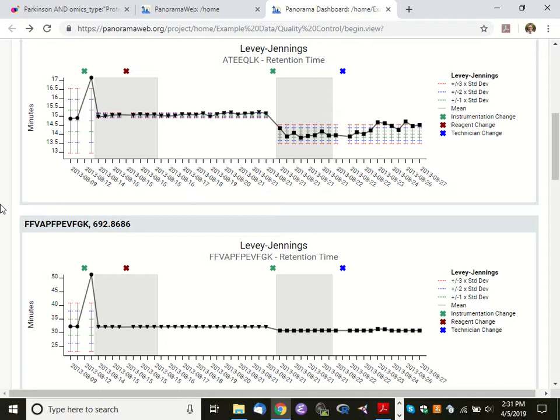We think of this as what's called a longitudinal analysis. Longitudinal. So this span of time is relatively short, but what we see is that the health of this instrument was profiled several times a day. Well, maybe not that frequently, but the 9th, the 12th, the 14th, and then the 15th, the 16th, 17th, 18th, 19th, 20th, many times on the 21st, many times on the 22nd.